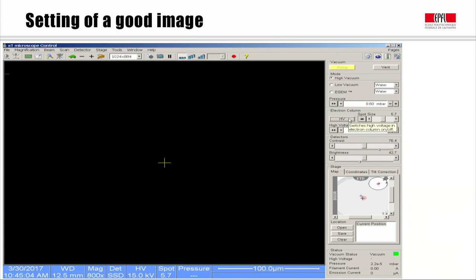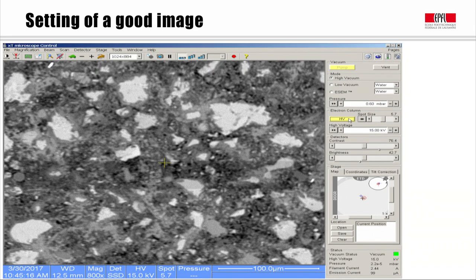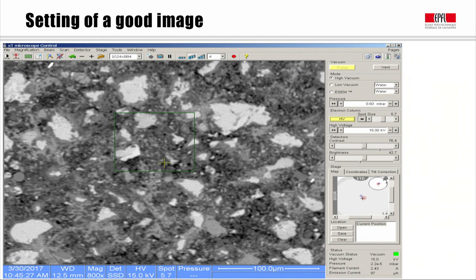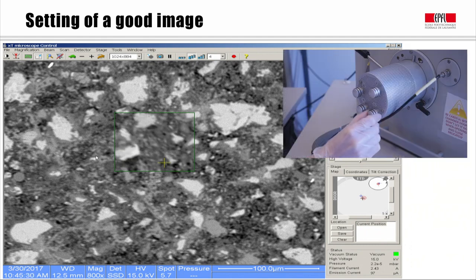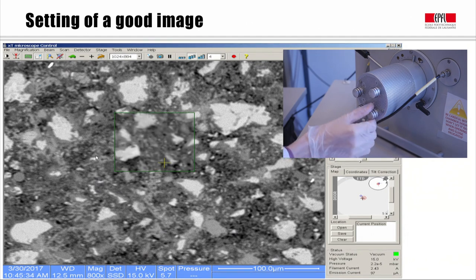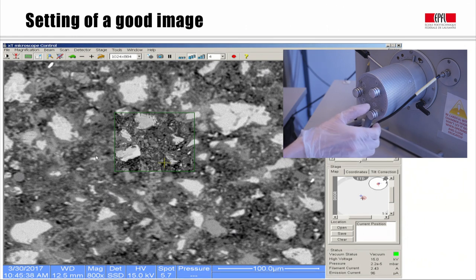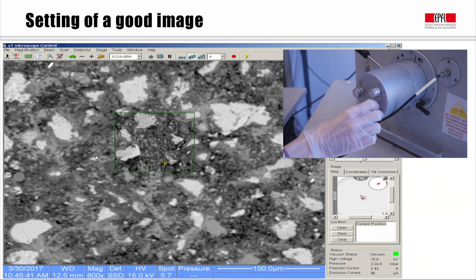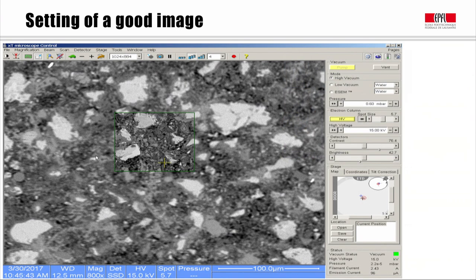When the vacuum is good enough, we can start applying a voltage, which leads to an emission of current and electrons sent to the sample. We click on HV and progressively an image appears on screen. We start collecting backscattered electrons, and the contrast shows different phases in the cementitious material. The image is a bit blurred because we are not exactly in focus, so we need to set the focus to get the best resolution. To change the focus, we adjust the Z position of the stage to ensure the sample is at the correct height and working distance.